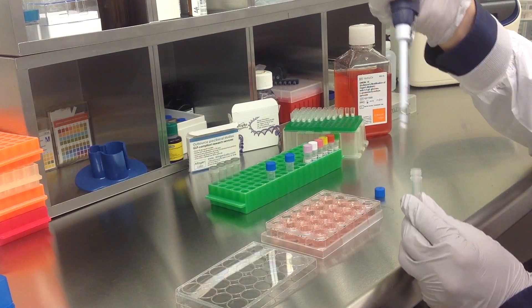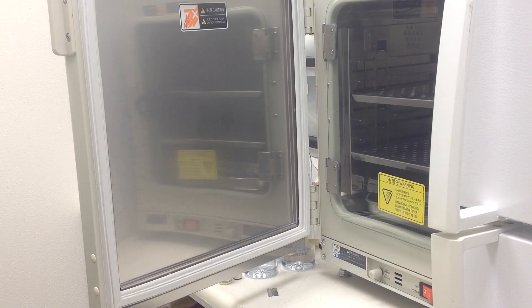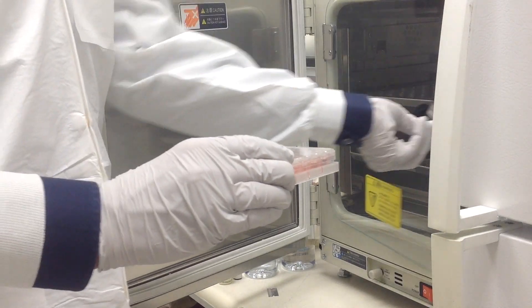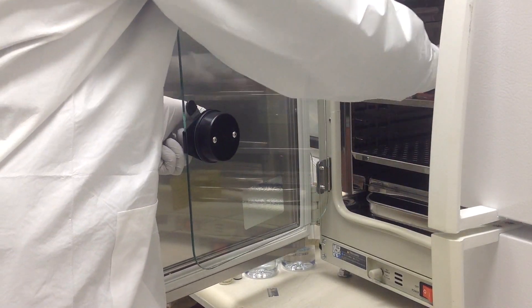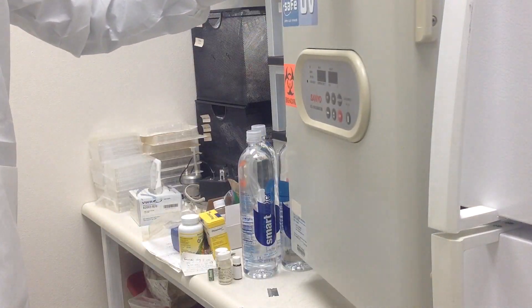Once you have treated all appropriate samples, incubate the cells at 37 degrees Celsius in a humidified carbon dioxide incubator. Assay for phenotype or target gene expression 48-72 hours post-transfection.